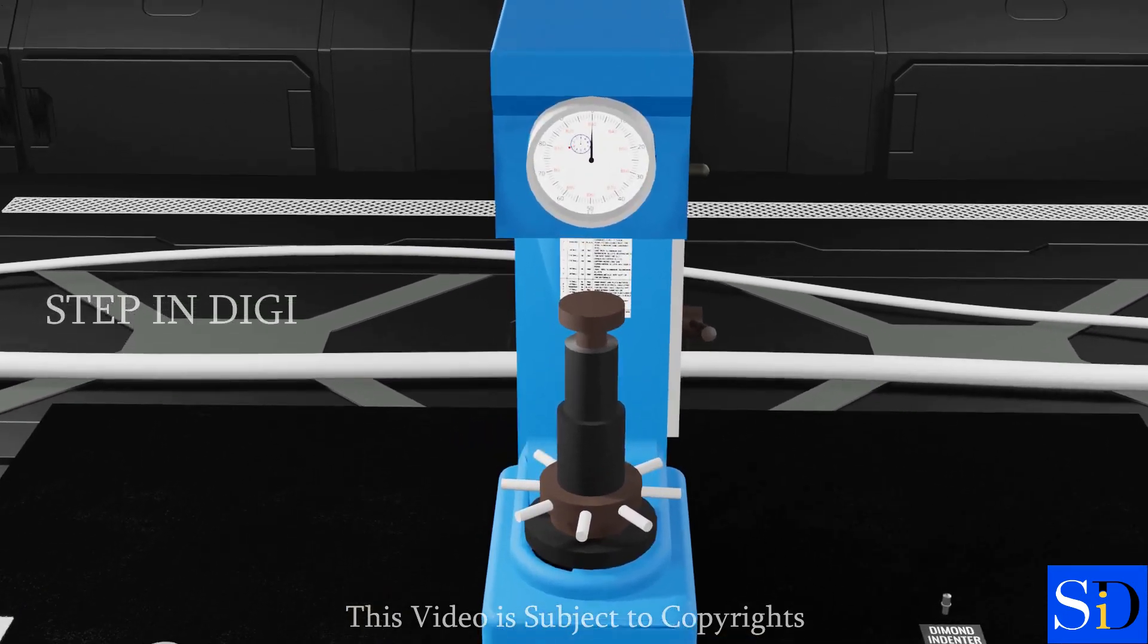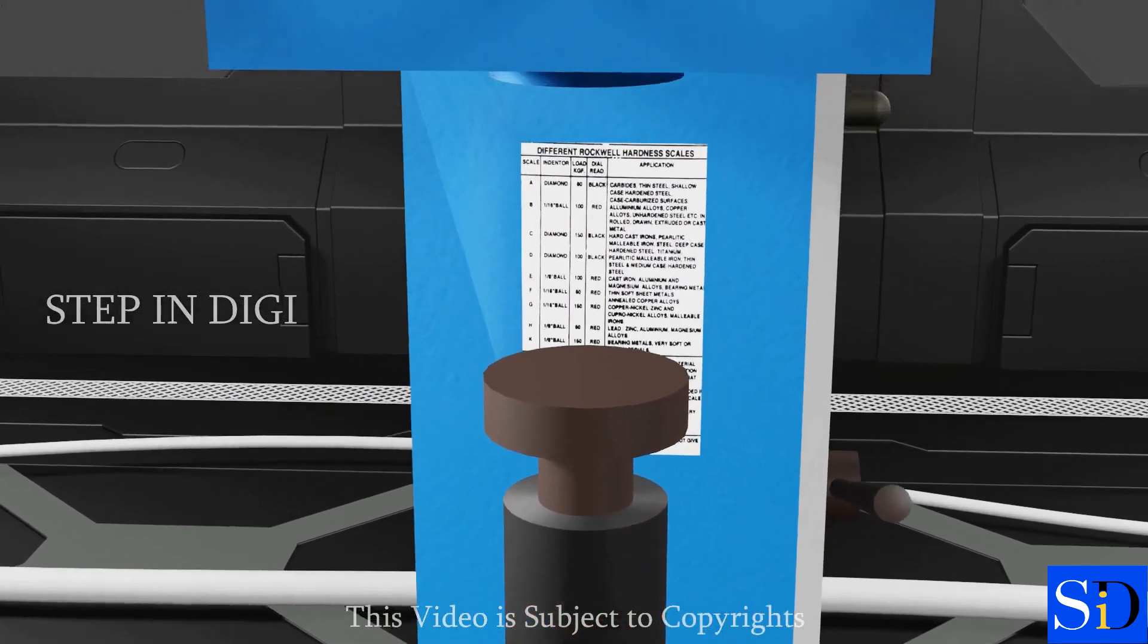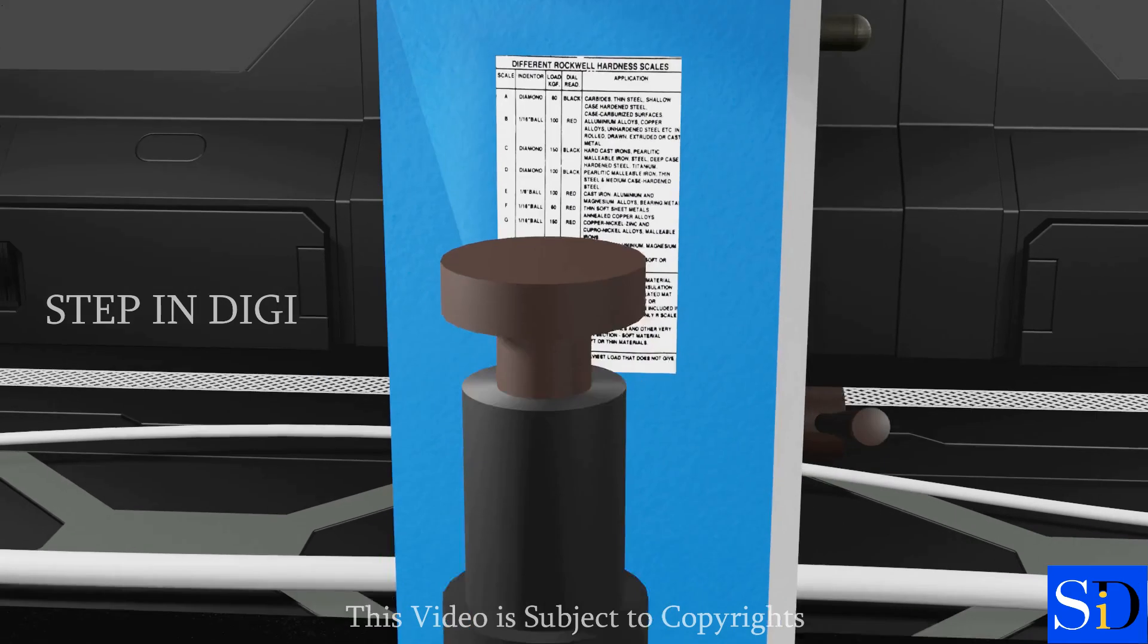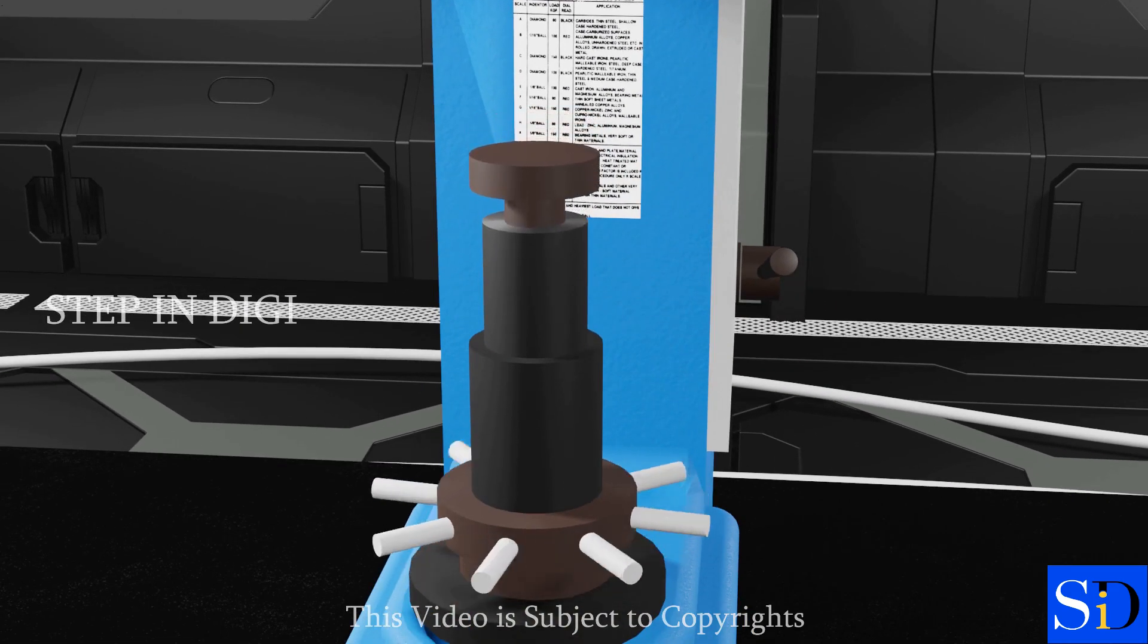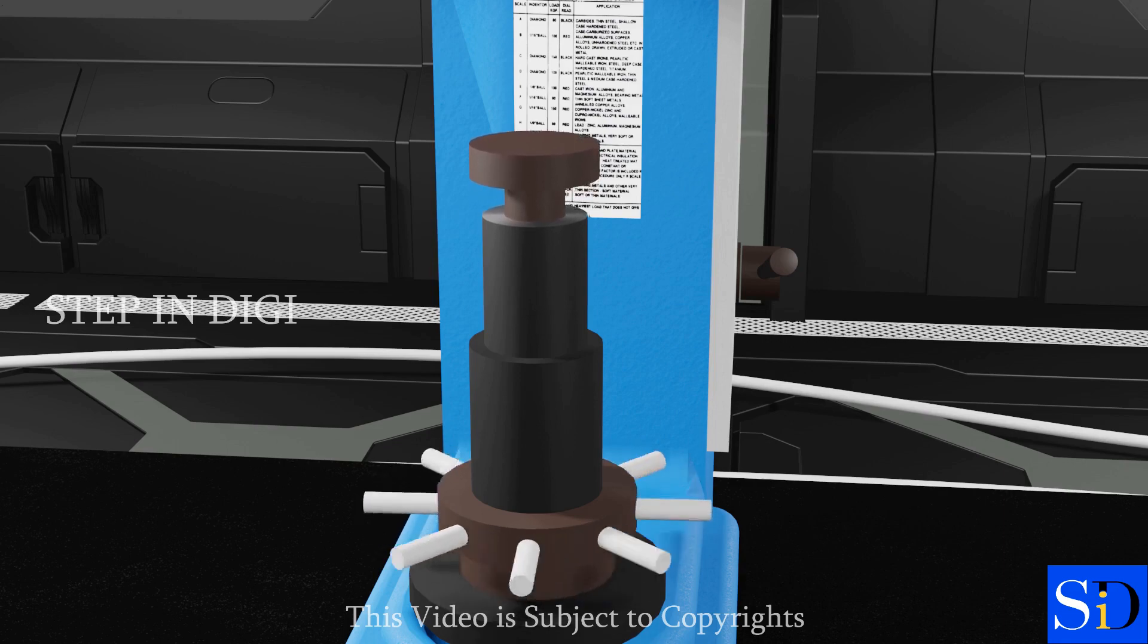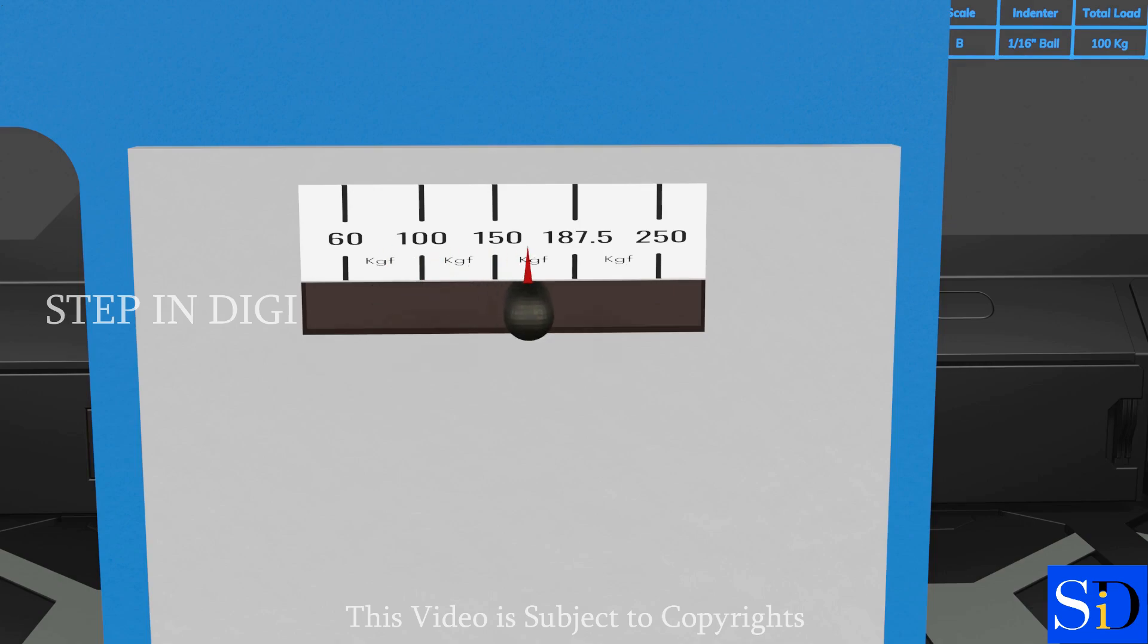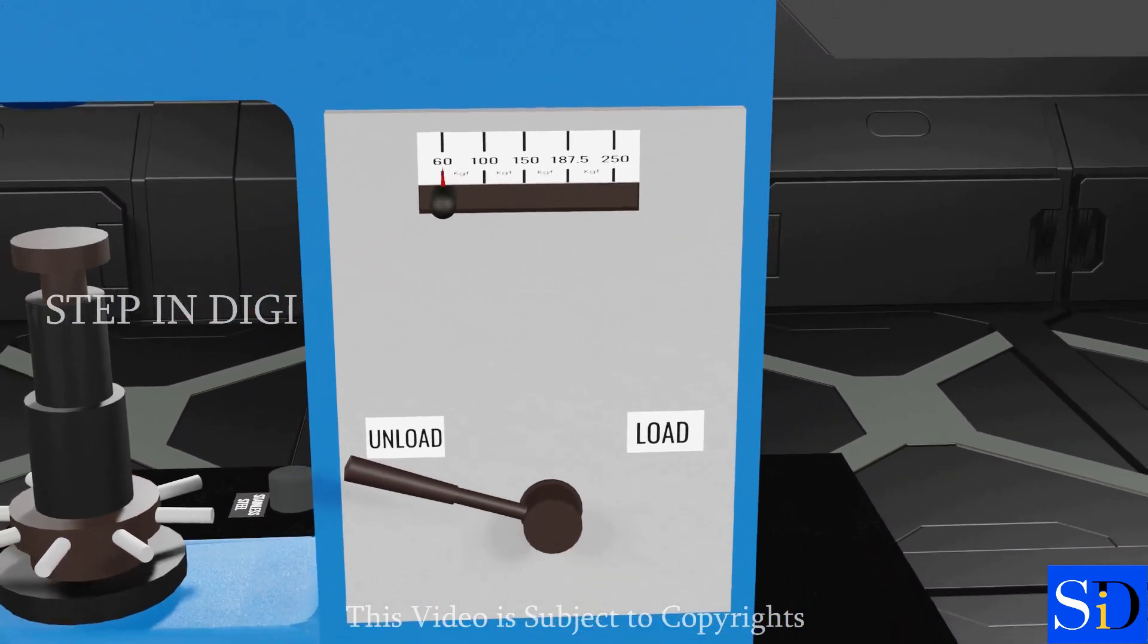Rockwell Hardness Testing Machine essentially consists of the following: 1. A supporting table for placing the specimen. 2. A hand wheel to raise or lower the supporting table. 3. A switch to change between loads. 4. A lever to load and unload the major loads.